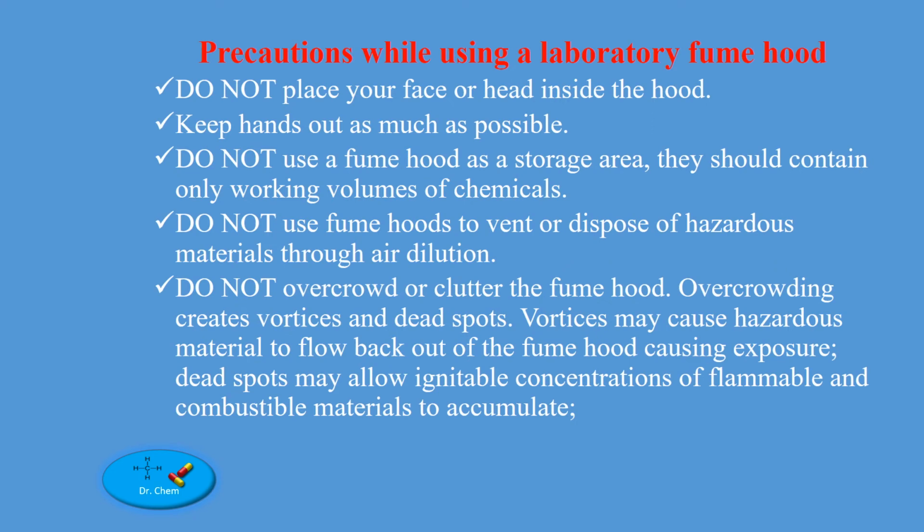Precautions while using a laboratory fume hood. Do not place your face or head inside the hood. Keep hands out as much as possible. Do not use a fume hood as a storage area. They should contain only working volumes of chemicals. Do not use a fume hood to vent or dispose of hazardous materials through air dilution. Do not overcrowd or clutter the fume hood.